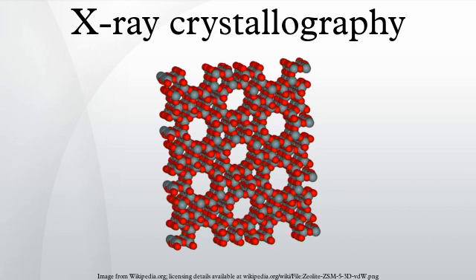X-rays range in wavelength from 10 to 0.01 nanometers. A typical wavelength used for crystallography is 1 Å, which is on the scale of covalent chemical bonds and the radius of a single atom. Longer wavelength photons would not have sufficient resolution to determine the atomic positions. At the other extreme, shorter wavelength photons such as gamma rays are difficult to produce in large numbers, difficult to focus, and interact too strongly with matter, producing particle-antiparticle pairs. Therefore, X-rays are the sweet spot for wavelength when determining atomic resolution structures from the scattering of electromagnetic radiation.